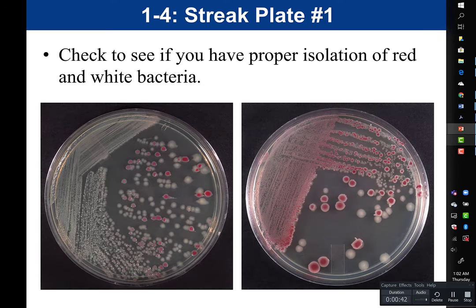When evaluating a streak plate, you want to see if you have isolation. Remember our plate will have four quadrants, and our broth is a mixture of red and white bacteria, so we're trying to see: do we have isolated red and white colonies? Both example plates shown are good examples of streaking for isolation, because we have isolated both white and red colonies — white ones here and here, red colonies by themselves here and here. There are a lot of colonies that could be used on either plate.